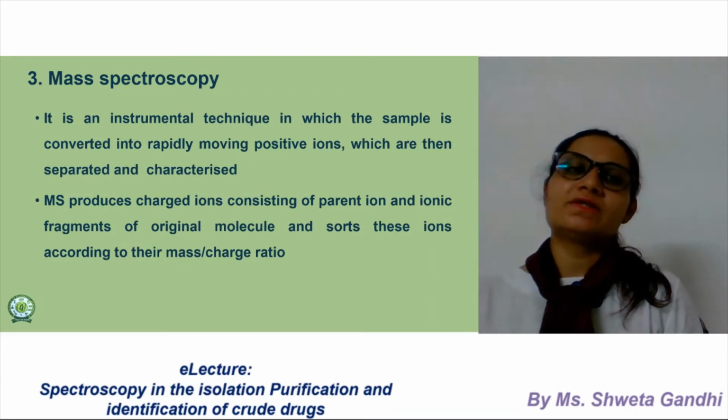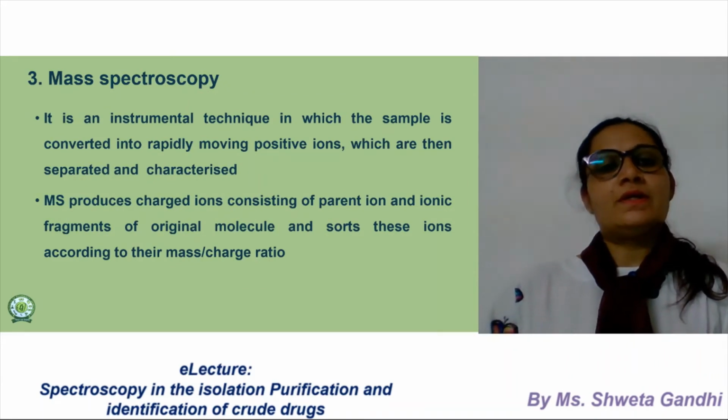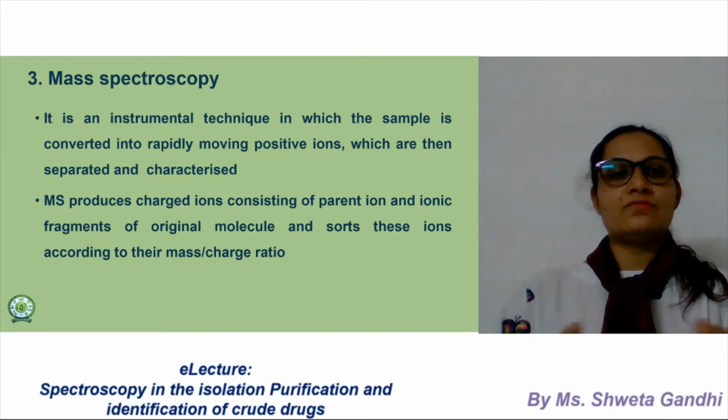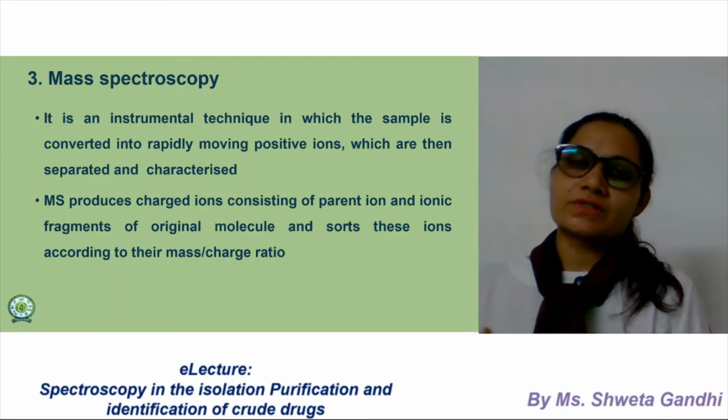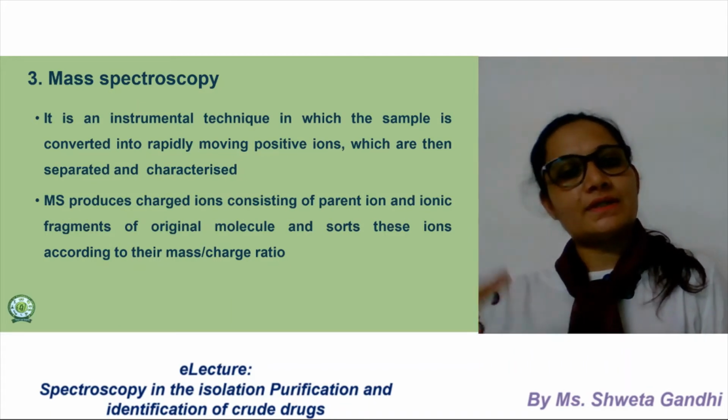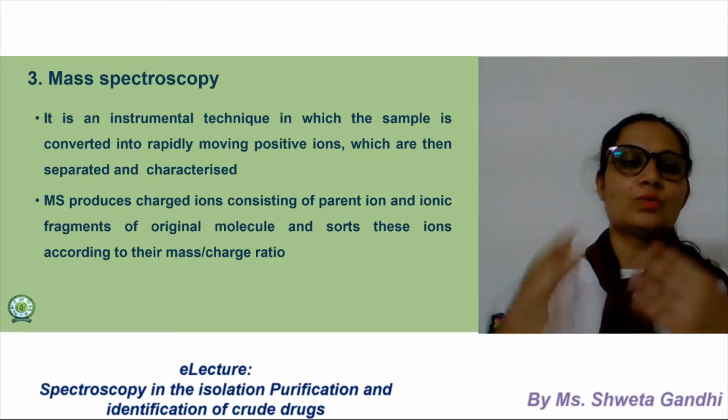Next, our third one is mass spectroscopy. It is an instrumental technique in which the sample is converted into rapidly moving positive ions and then separated and characterized. Here, the role of ions.